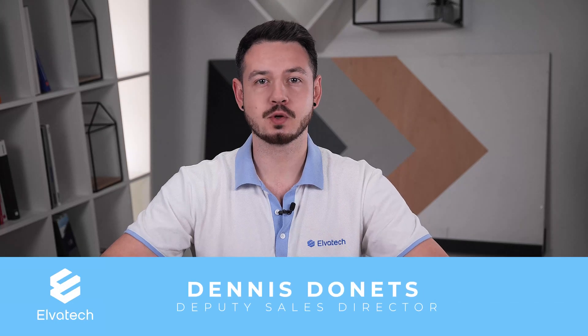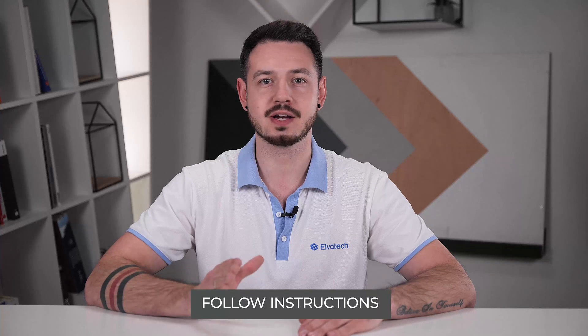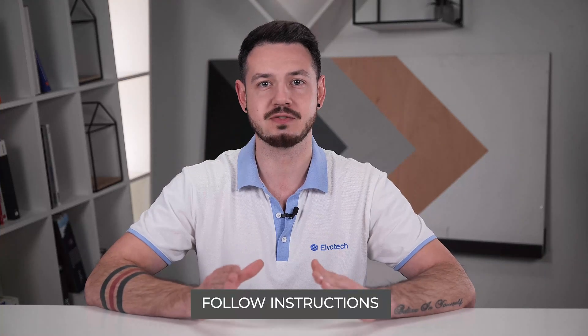Hello and welcome to our training video on how to safely operate handheld and benchtop XRF fluorescence analyzers. These advanced devices are used in a variety of industries, from geology to quality control, and can accurately determine the chemical composition of various materials. Our recommendations will help you ensure safety and efficiency when working with these sophisticated and precise tools. Follow our instructions to maximize the performance of the analyzer and ensure your safety in the process.